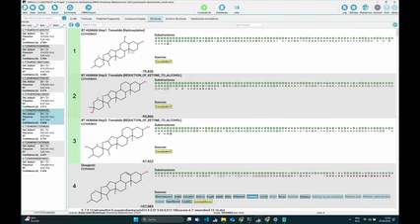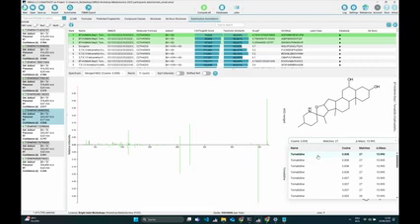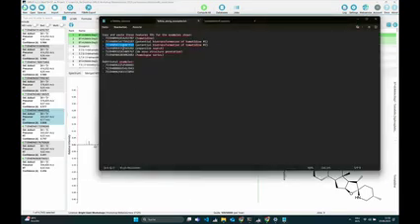Okay, this is one I wanted to show here. You can still see if it matches, and it seems to match quite well. Just as a quick repetition of the example before, we can still do our analog search and find out that we still have a very good hit to tomatidine. Let's just select some of these, and you can now compare the spectrum of this compound with tomatidine again and see if it matches. Okay, now we looked at MAF tomatidine examples.